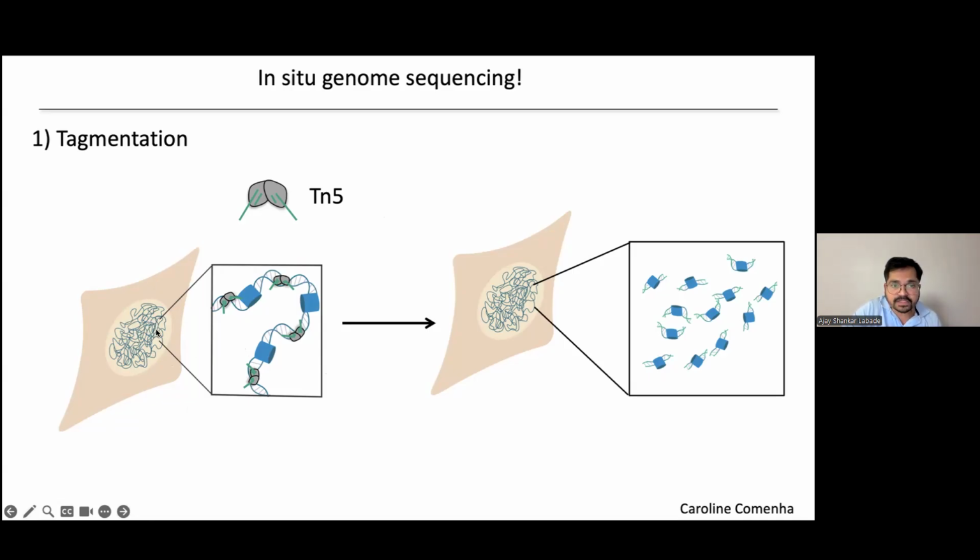And remember, the cells are fixed, so the proteins are still there, fixed by formaldehyde. They form covalent bonds with the DNA, so the DNA still stays inside the nucleus, right? Even after the tagmentation. A few free fragments that we have noticed sometimes do move out, they diffuse out, but we do not care, as less than 1% of the genome is in fact completely free of proteins.